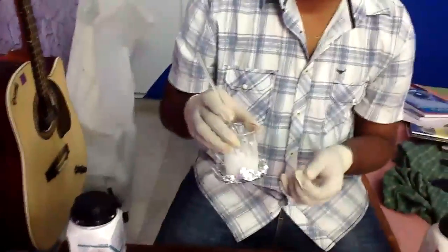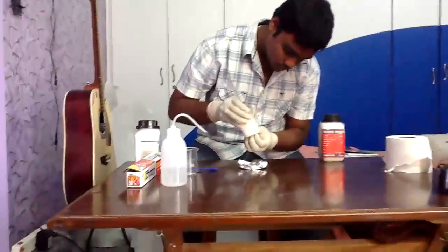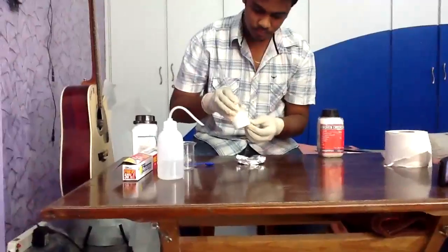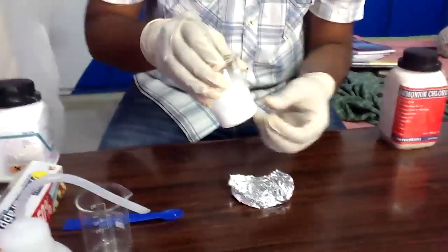Now you can see the water between the foil and the beaker has frozen to a solid, and due to that solid, the foil is sticking to the beaker. Now I am going to show some pieces of ice too. You can see bits of ice flakes sticking beneath the beaker.